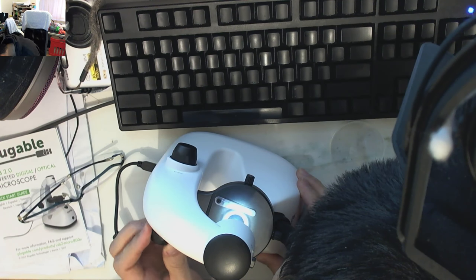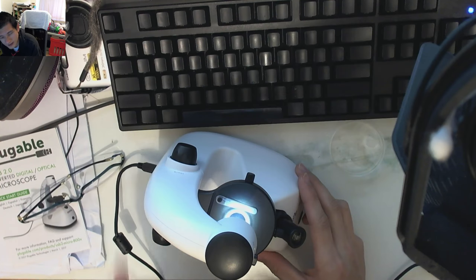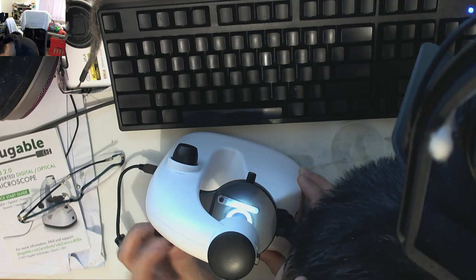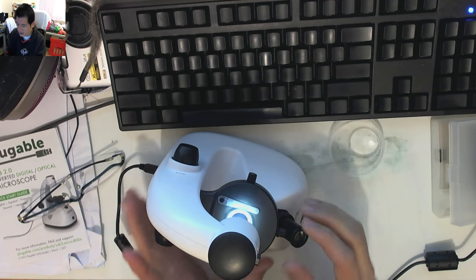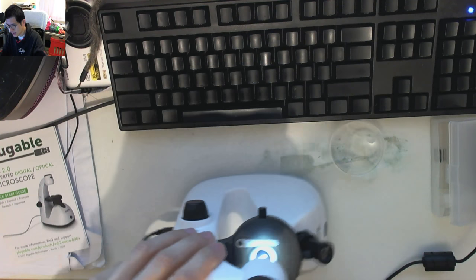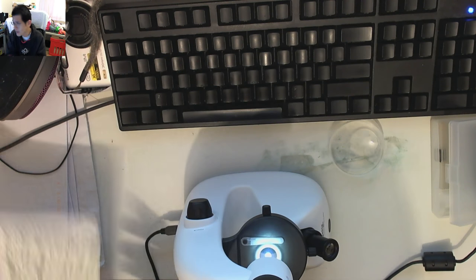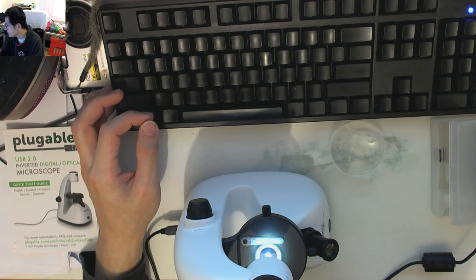Even with nothing on the plate I can say the focus is actually working — you can see it's trying to focus on the dust on the surface. On the lowest intensity it isn't hurting my eyes, but I can imagine if you jacked it up quite bright you probably would actually hurt your eyes, so be very careful when using it in the manual optical mode.